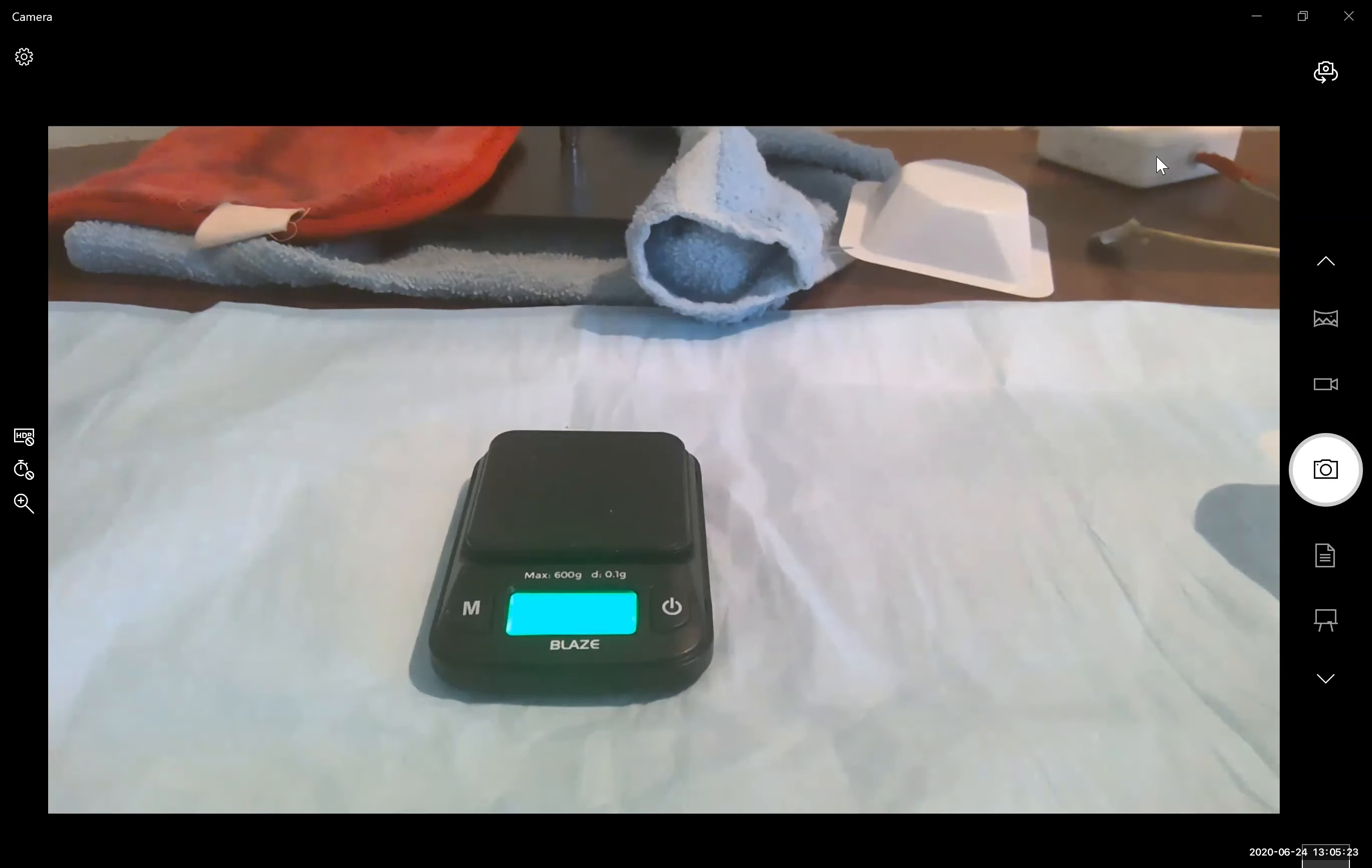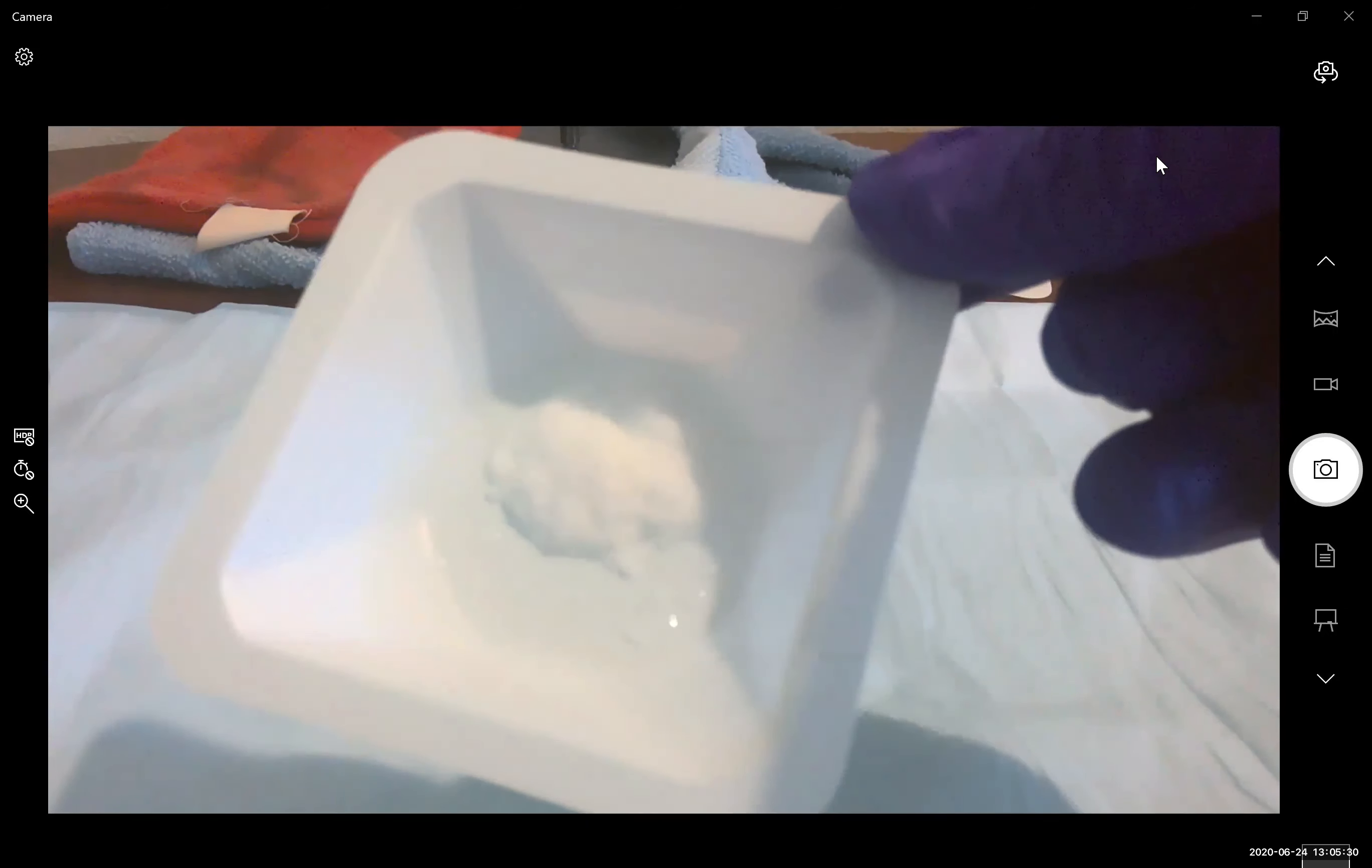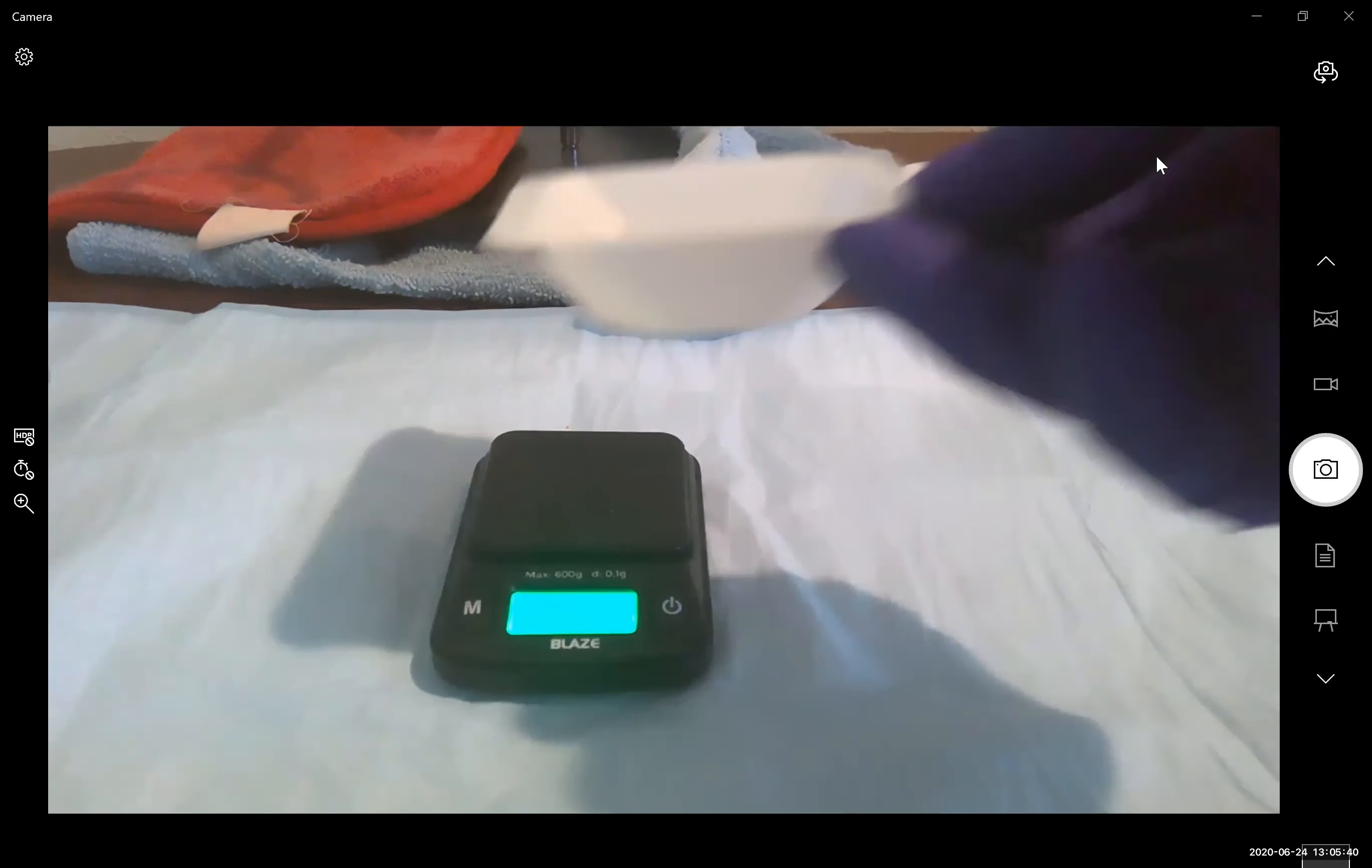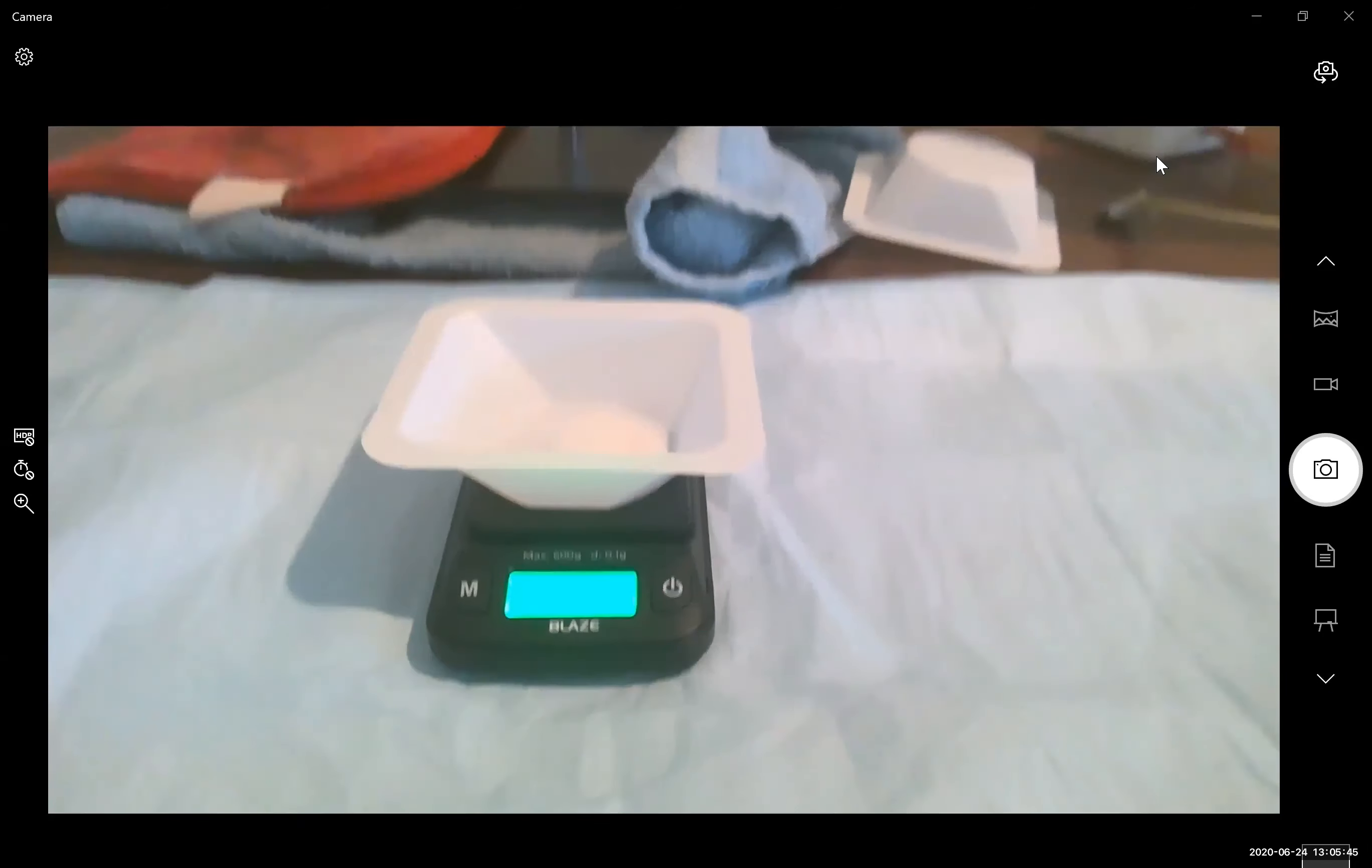Now we're also going to check in on our sample of calcium chloride. Now you may have a pretty nasty puddle of calcium chloride in water. Calcium chloride is hygroscopic. It picks up water. So let's record the mass of our weigh boat and calcium chloride that we left from last session.